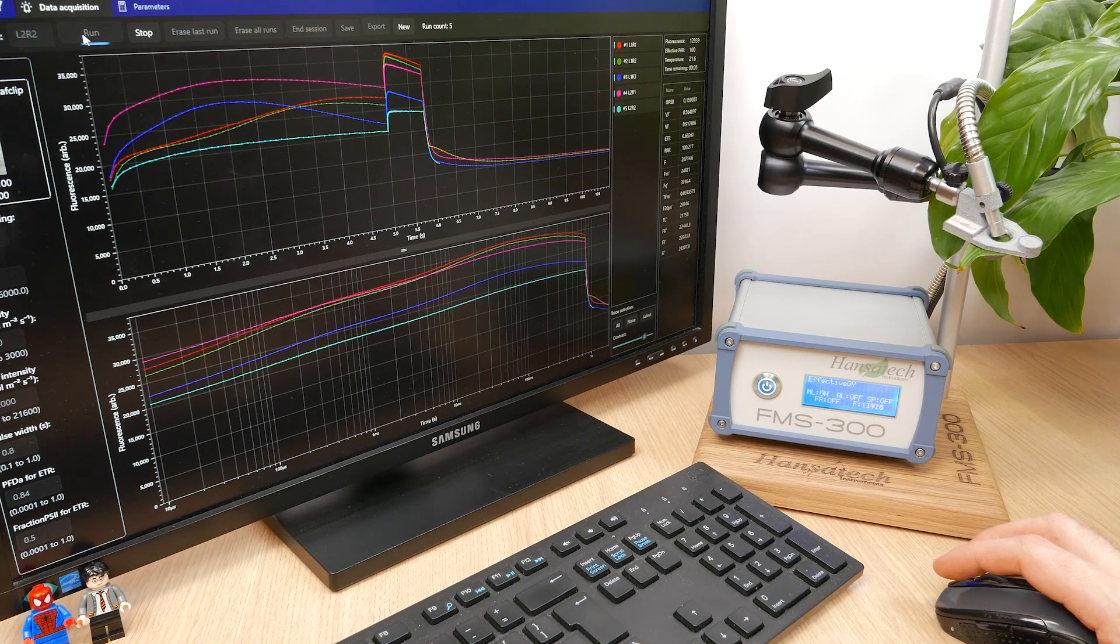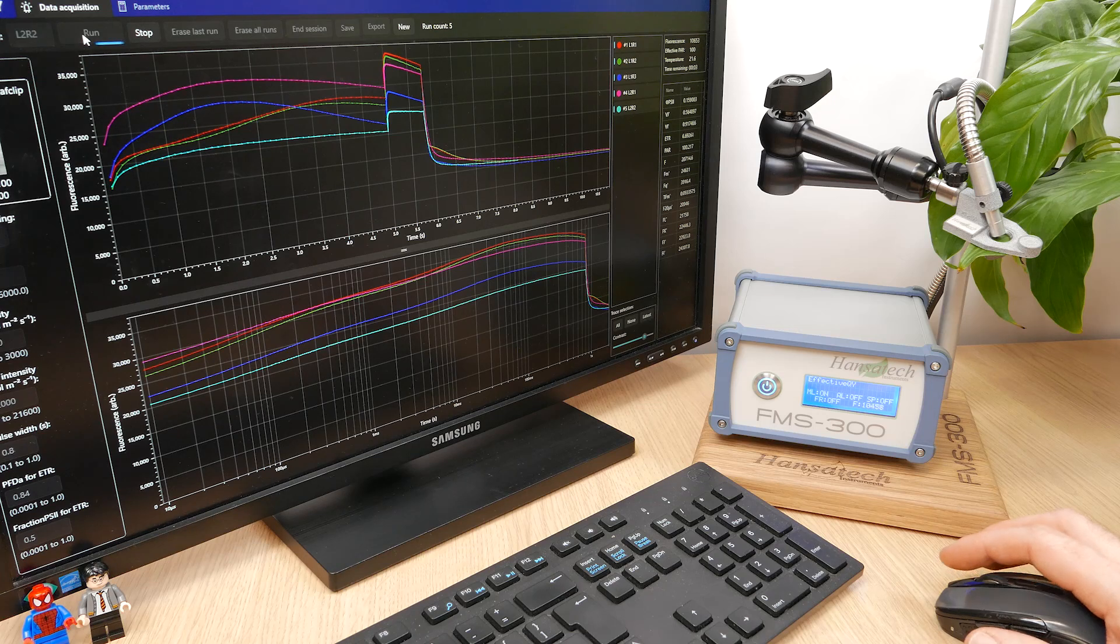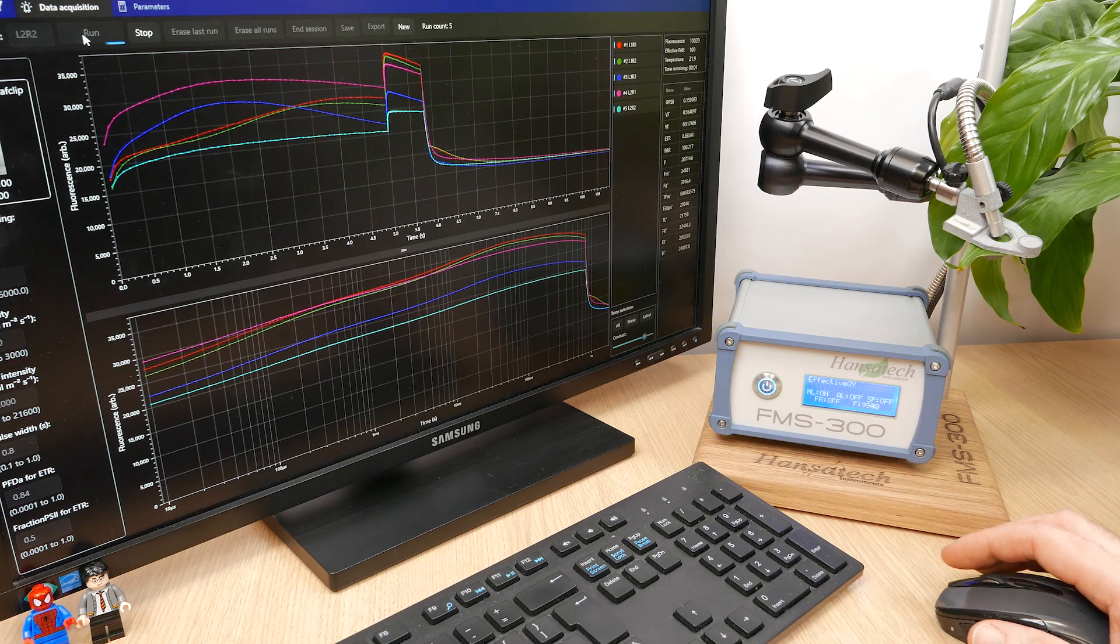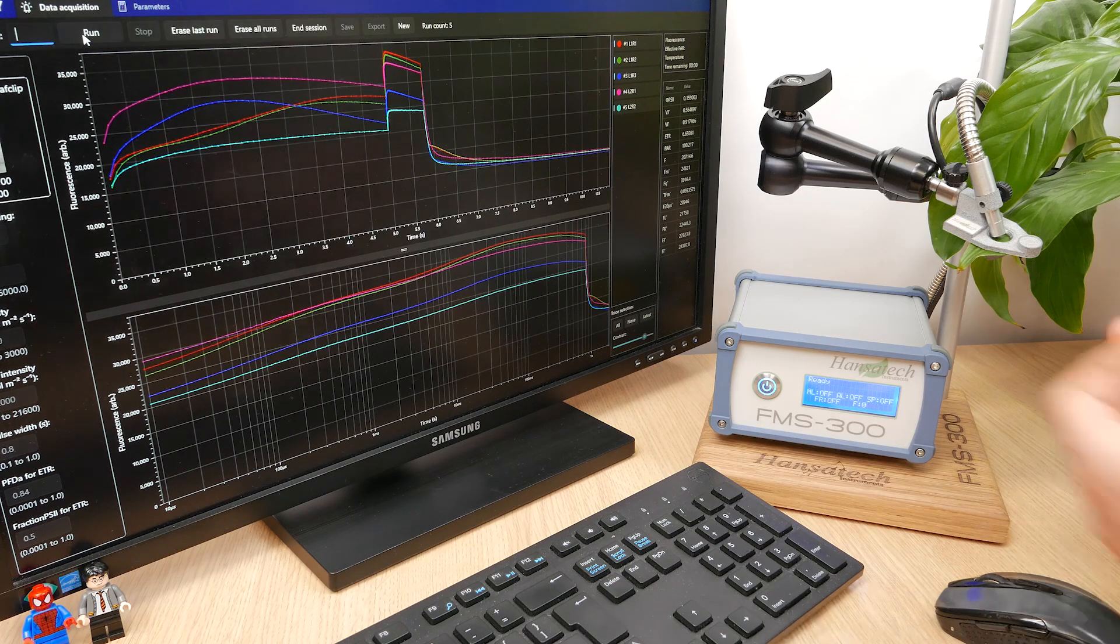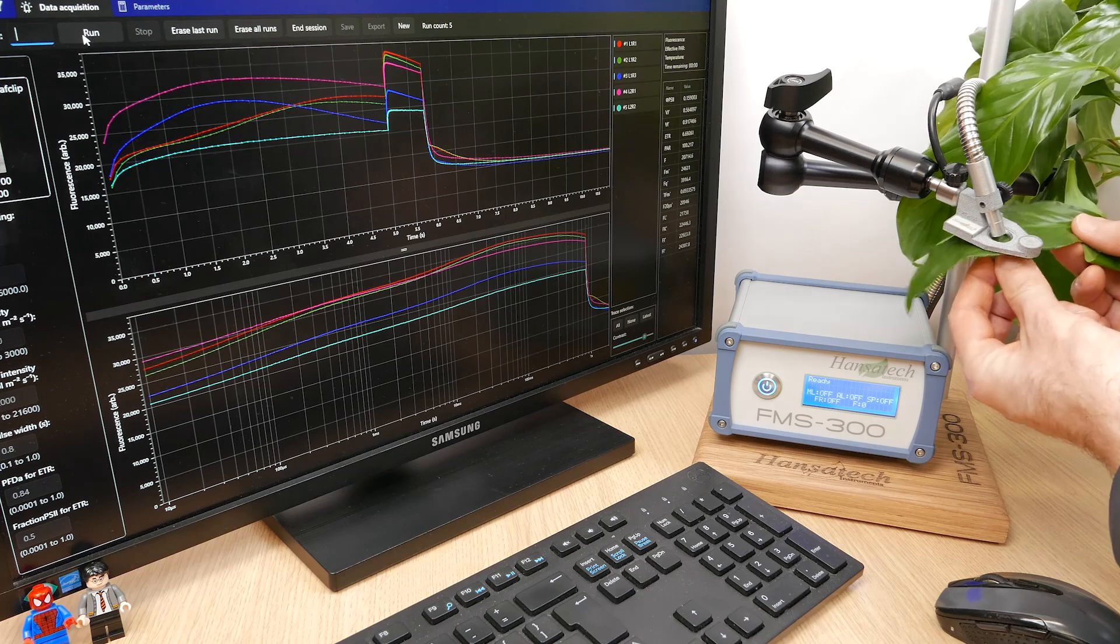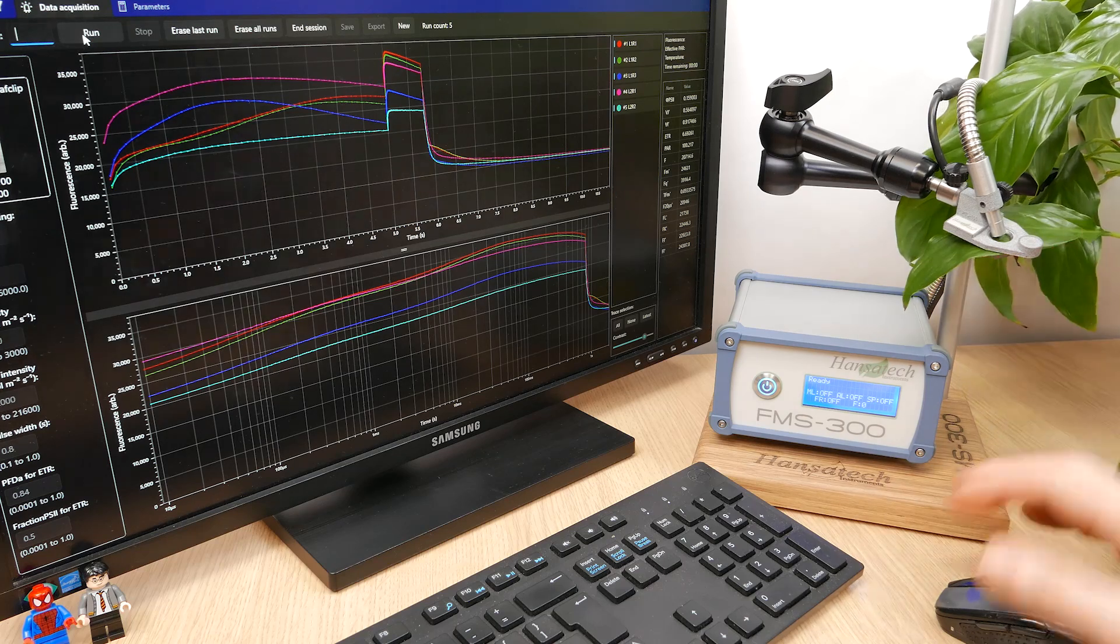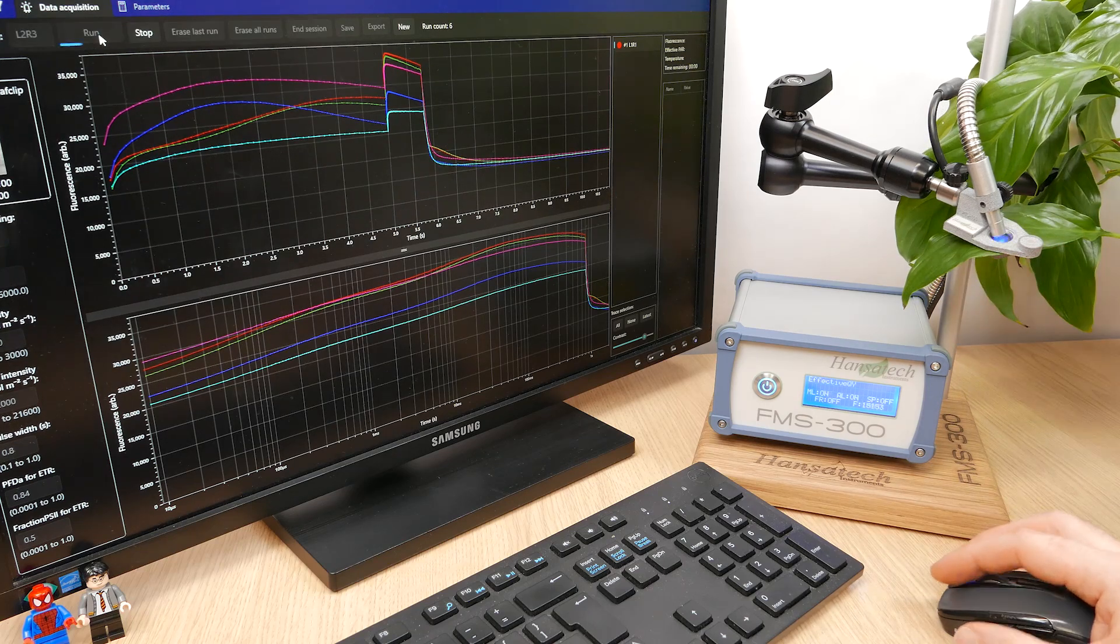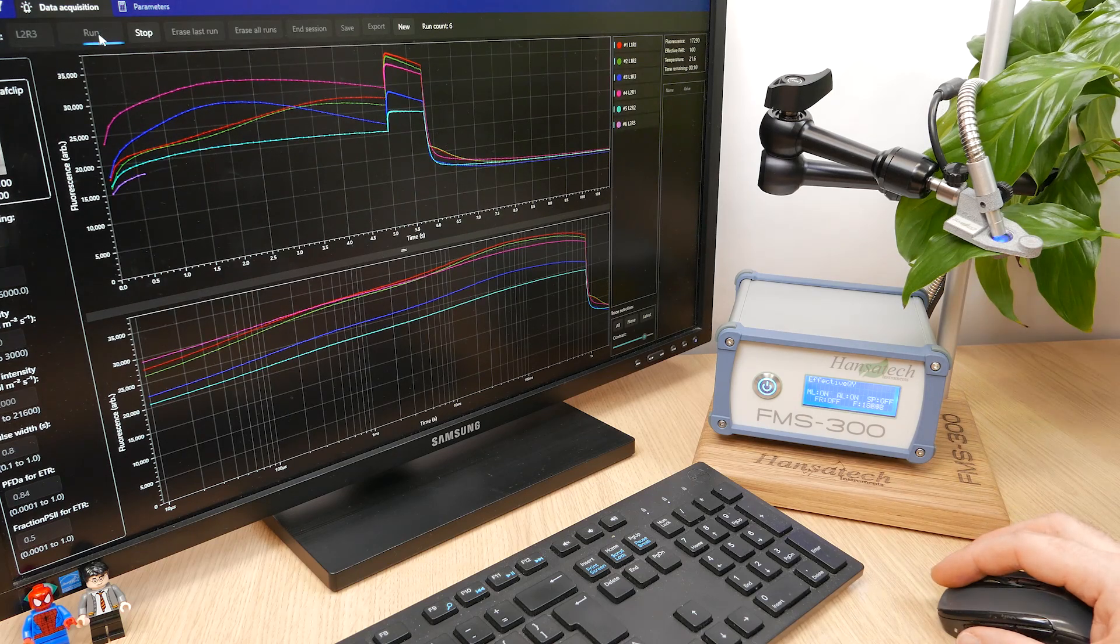With the FMS 300, you can also perform multiple replications within a single data file, using the multiple measurement feature for maximum or effective quantum yield.